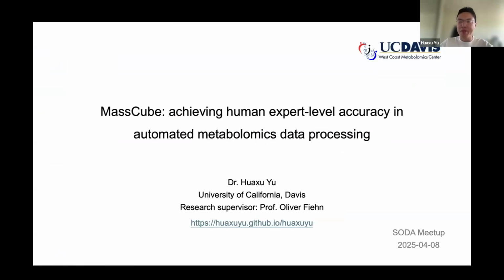So actually, I'm also a big fan of SODA, and basically, I watch almost every SODA meeting. So today I'll be talking about a new work we did recently. It's about a Python framework for metabolomics data processing. So I changed the title a little bit to focus on the accuracy today.